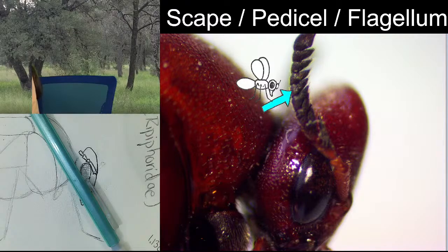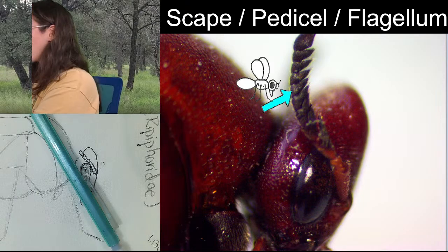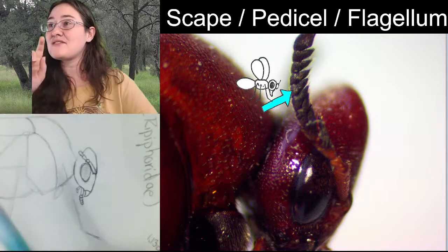One, two, three, four, five, six, seven, eight, nine. All right, there are 9 segments in the flagellum.